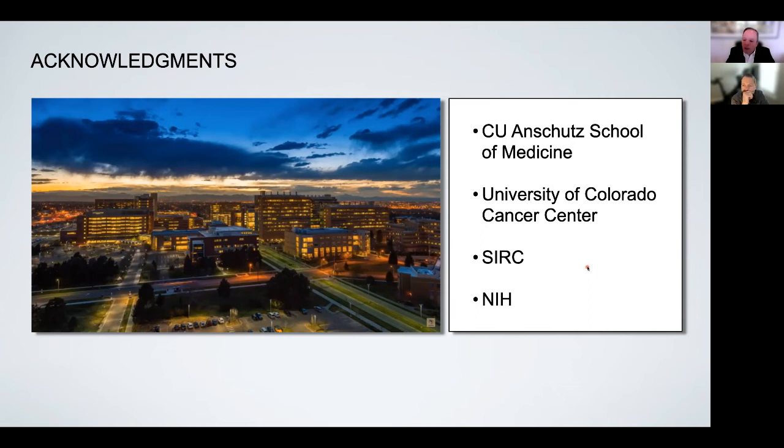Because in order to obtain images of single molecules, you end up working at very low concentrations typically. So one thing to think about is, what is the KD for the association between these two molecules? Will they remain associated under the conditions that are required for EM imaging? And of course, there are ways around that.